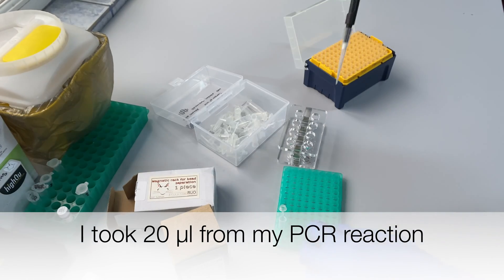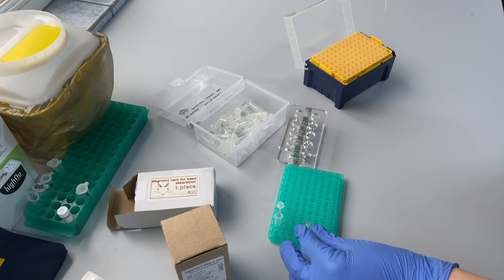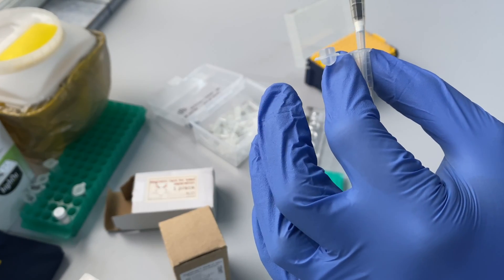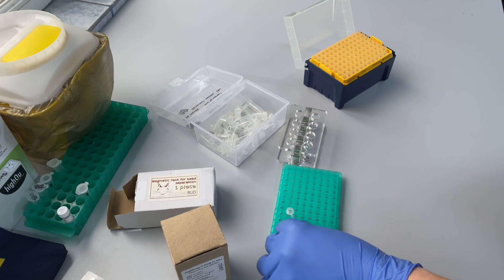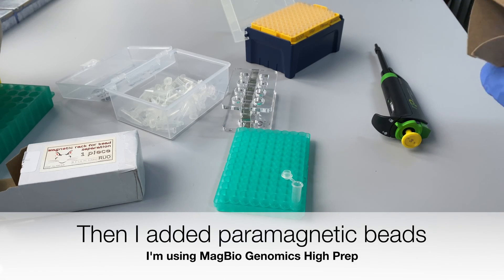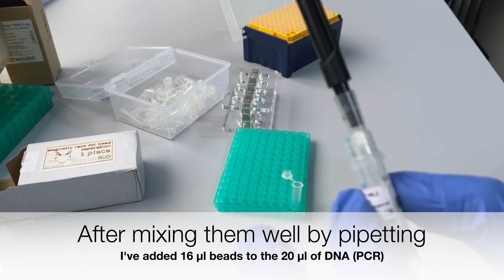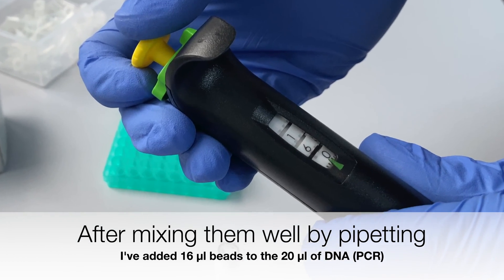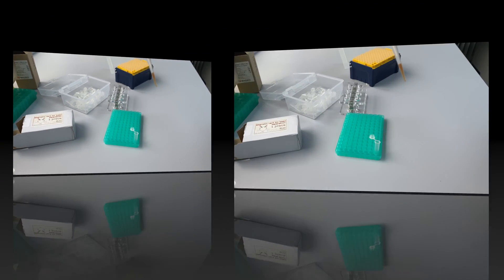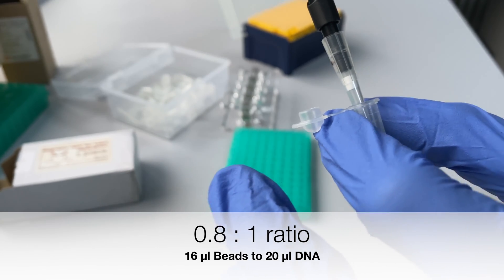First, I took 20 microliters from my PCR reaction and transferred them to a reaction tube. I then added the beads — I'm using HighPrep MagBio Genomics beads here. After mixing the beads very well by pipetting, I added 16 microliters of beads to the 20 microliters of PCR reaction. This 0.8 to 1 beads-to-DNA ratio will allow me to separate the small fragments from the larger ones.